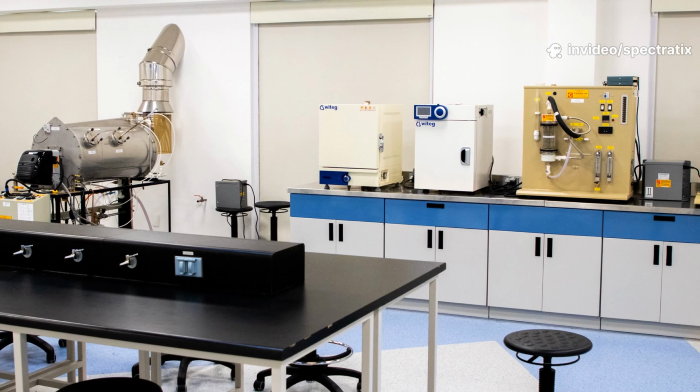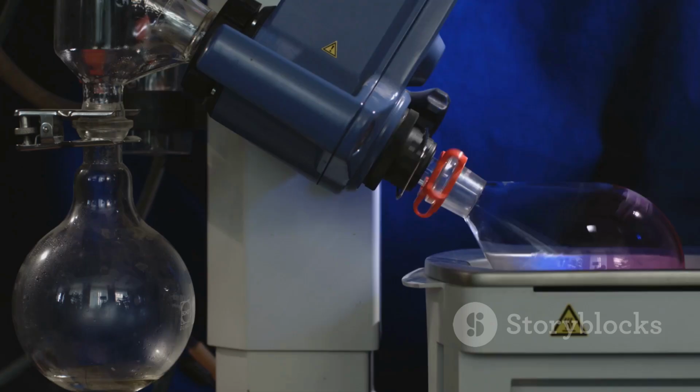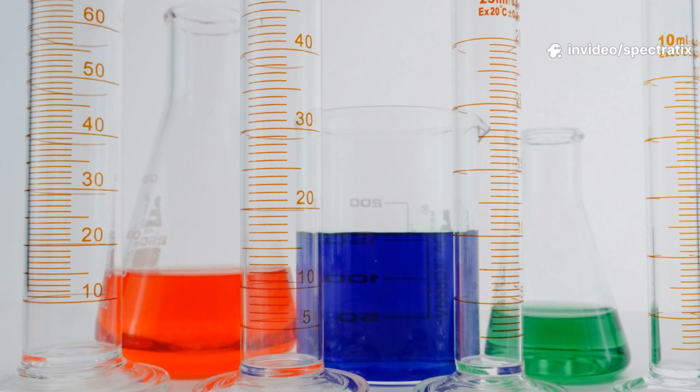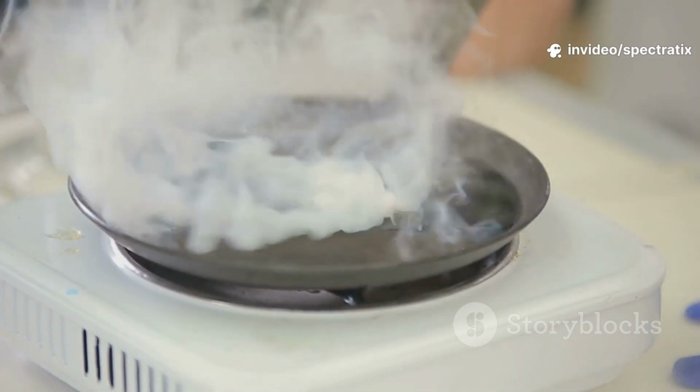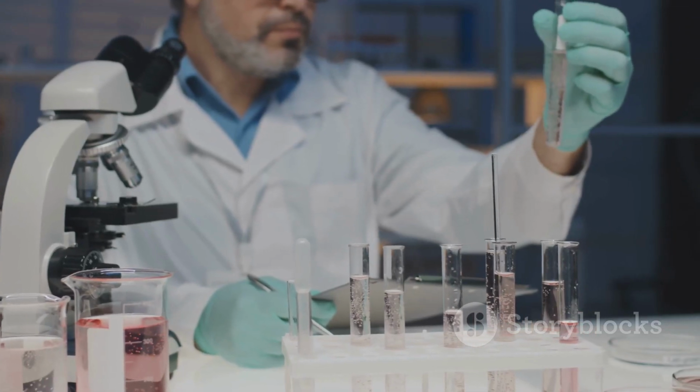Why is GC so popular? It's fast, highly sensitive, and incredibly specific. If your compound can be vaporized without breaking down, GC will probably separate it for you. But there are limitations. Non-volatile or thermally unstable compounds aren't suited to gas chromatography. For those, you'll need a different technique.